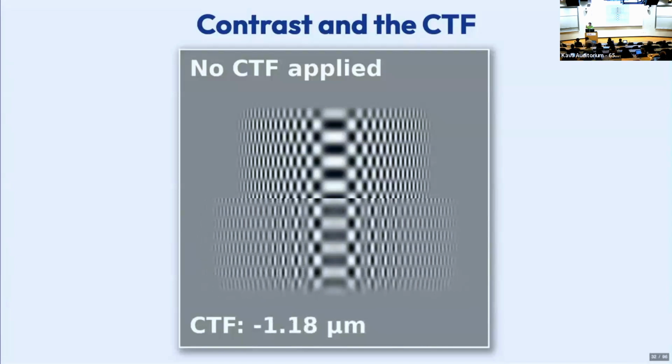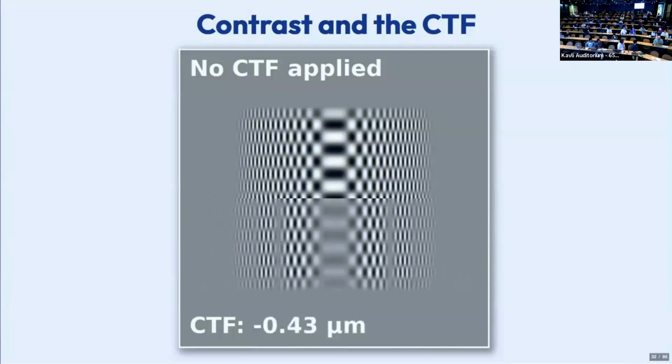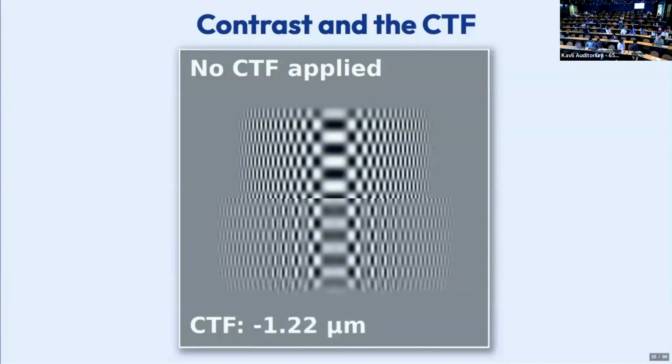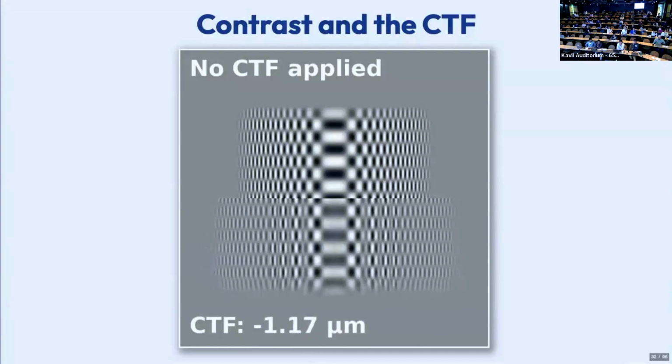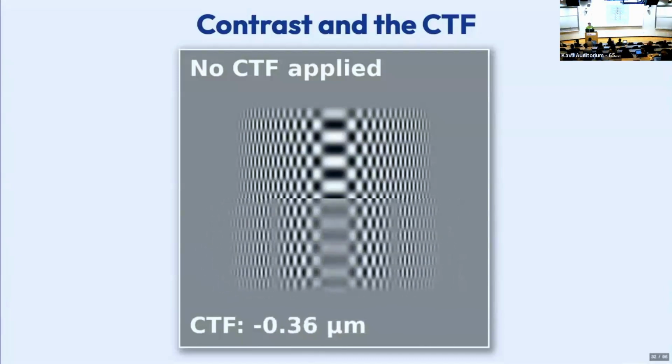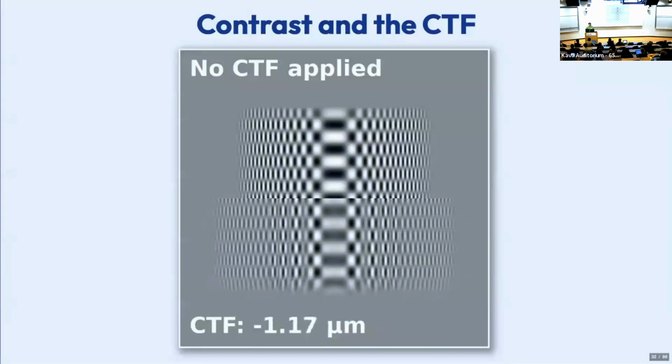I think we have one in person. A very nice question. So how do you decide what is the best defocus range for your data collection? That is a really good question, which I'm not sure there is an answer to, and I certainly don't have one. I think there are rules of thumb where you stick around the, now I'm going to say what my rule of thumb was when I was collecting data, and then immediately everyone's going to disagree with me.